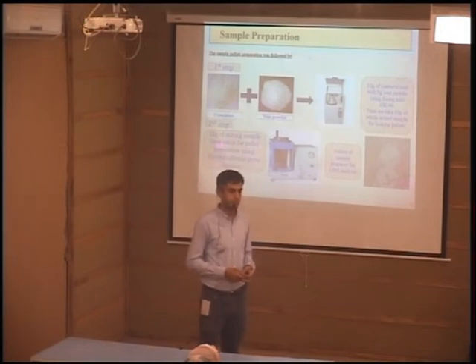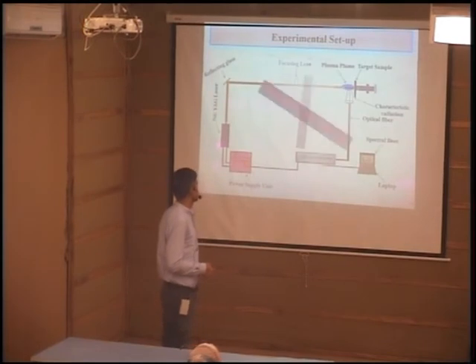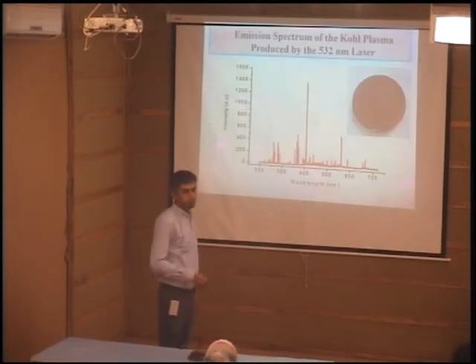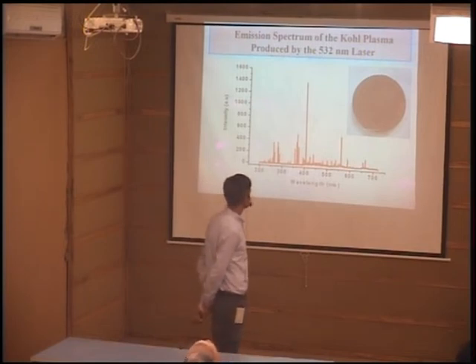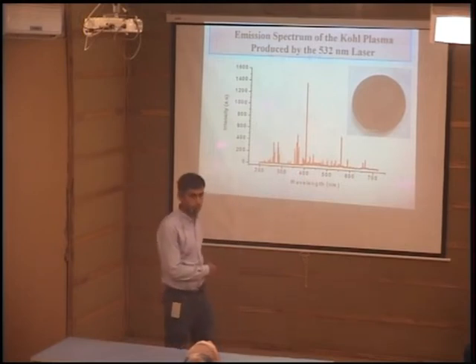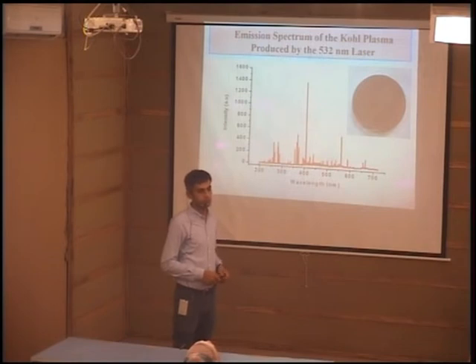Okay. Can you move to slide number 17 also? So what is this big, high intensity line around 400 nanometer? This one? Yeah. This is basically the calcium line, 422. Okay. So all these elements you found here, are they in their elementary form or are they also oxides? No, elemental form. Elemental form. Yes.